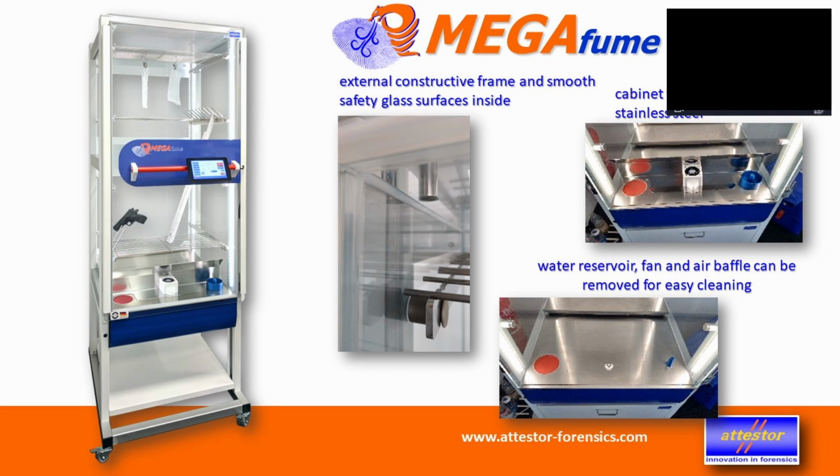That's made from aluminum. We can't make it from stainless steel because stainless steel is a very bad thermal conductor. So it must be aluminum. We have coated it with anodizing coating, which hardly takes on any cyanoacrylate. So it's super easy to clean. Disadvantage is a bit, you shouldn't put it into the dishwasher because that takes off the anodizing. You then have a blank aluminum cup after, I don't know, 5 or 6 runs. It will still work, but it's a bit more difficult to clean.